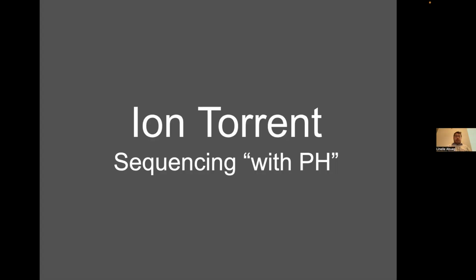Yeah. Then ion torrent sequencing with pH. So ion torrents, I think, still exist. I Googled it this morning, and they still sell it. I don't know where. It's in Europe, probably.